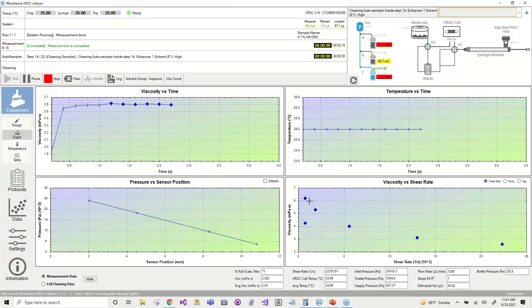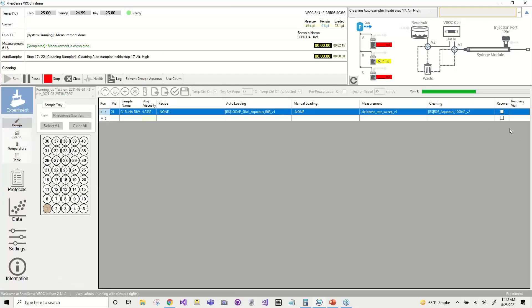The last two points before we go over exporting data: first is sample recovery. Now that this is done measuring, the system is waiting for the auto sampler to finish cleaning. Once the auto sampler is finished cleaning, it will then move and draw the sample and place it back into the vial. We don't have sample recovery enabled right now, but I just wanted to let you know that option exists. The last thing is the cleaning process. Once this is done cleaning the auto sampler syringe, the solvents will start flowing through the main flow path and cleaning it, and your system will be completely dry in preparation for the next sample.